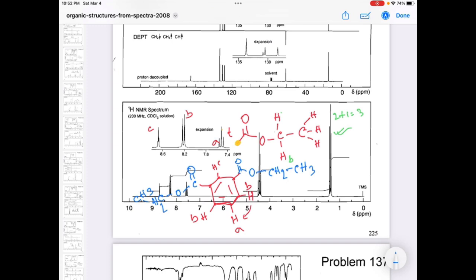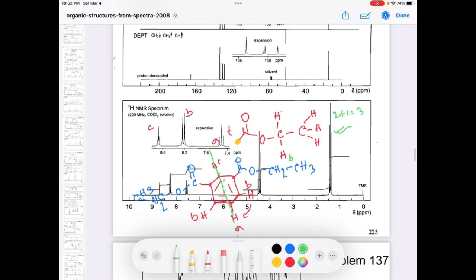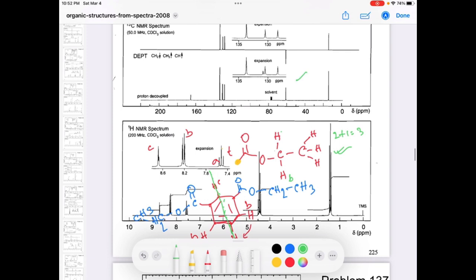So let's draw a line through the molecule. So this is one half, one side one half, another side another half. Another important thing is that the benzene ring can also give you meta coupling. Like if you have some group, suppose here is one group and here is one proton A and here is one proton B, so HA can also see B, but since it is a little bit far and also there is some group in the middle, it will give you a W coupling or a small coupling, which is a small splitting.